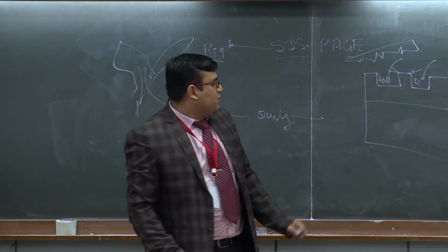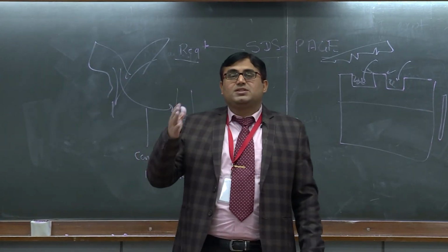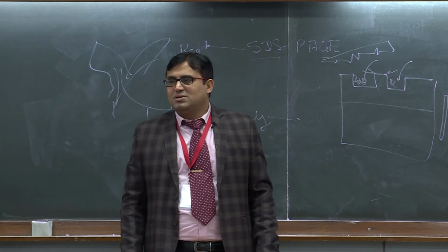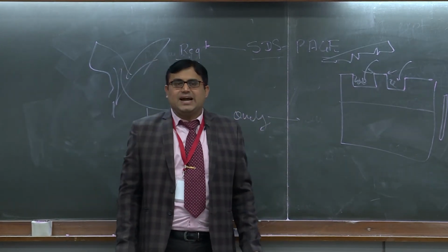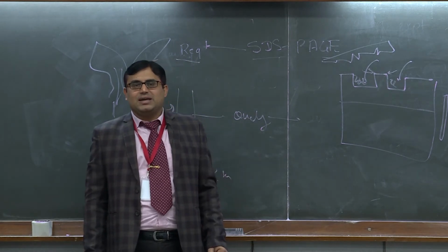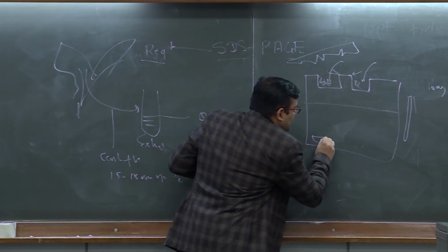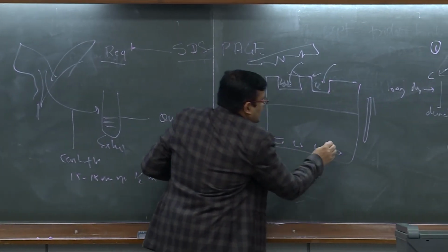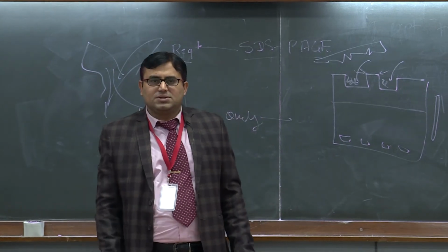Right? So once the run is complete, now you have to tell me how you are going to know whether the run has been completed or not. There is a tracking dye in this, bromophenol blue tracking dye. Based on the movement of the dye, once the dye reaches somewhere near the bottom, you have to stop your run. In case of a mini gel, it will take 2.5 hours, right?